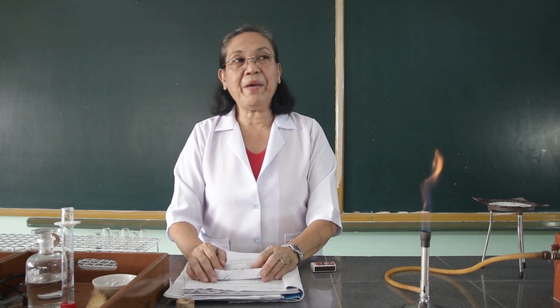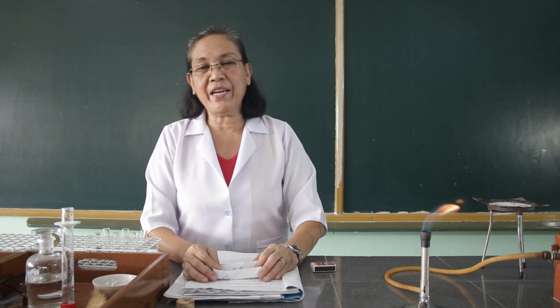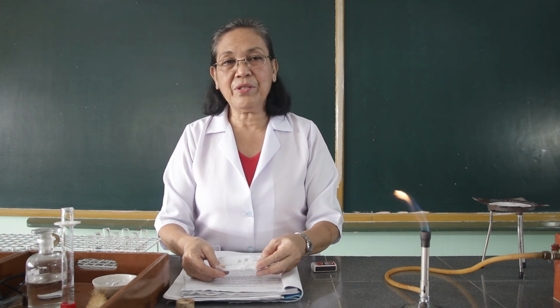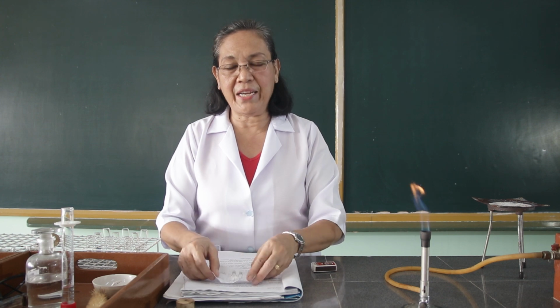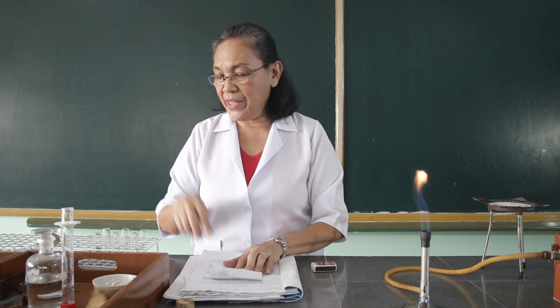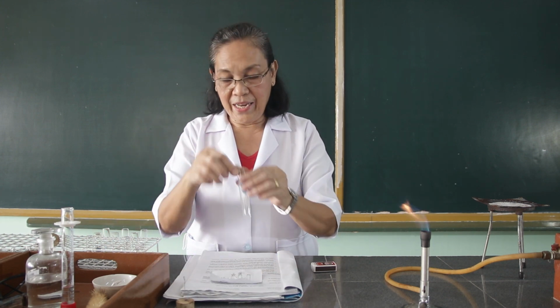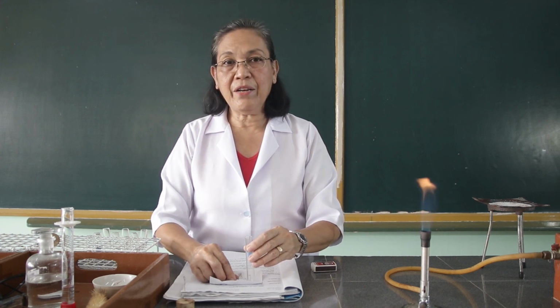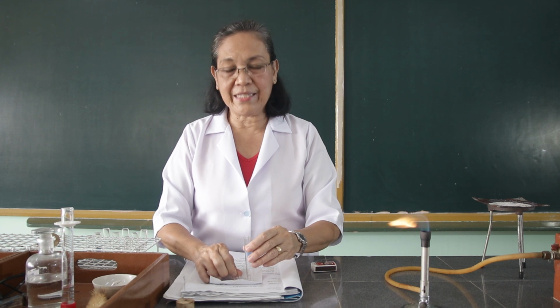The next ion to be analyzed is the potassium ion. This is to be taken from the compound potassium carbonate. So let us use a pinch of this potassium carbonate, place it into the vial, then add again 1 ml of water and 1 ml of hydrochloric acid.